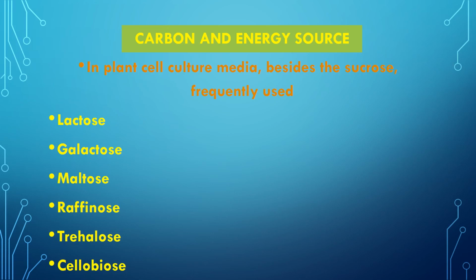The use of the individual sugars, that is glucose and fructose, ironically does not work as satisfactorily as sucrose. Similarly, filter sterilization of the sucrose solution before addition into the medium, as an alternative to autoclaving, also does not work satisfactorily.